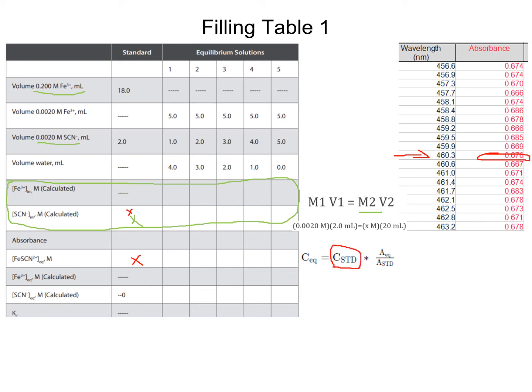So this value you already have, and then to compare with the other samples, you have, for example, this absorbance value of the standard.